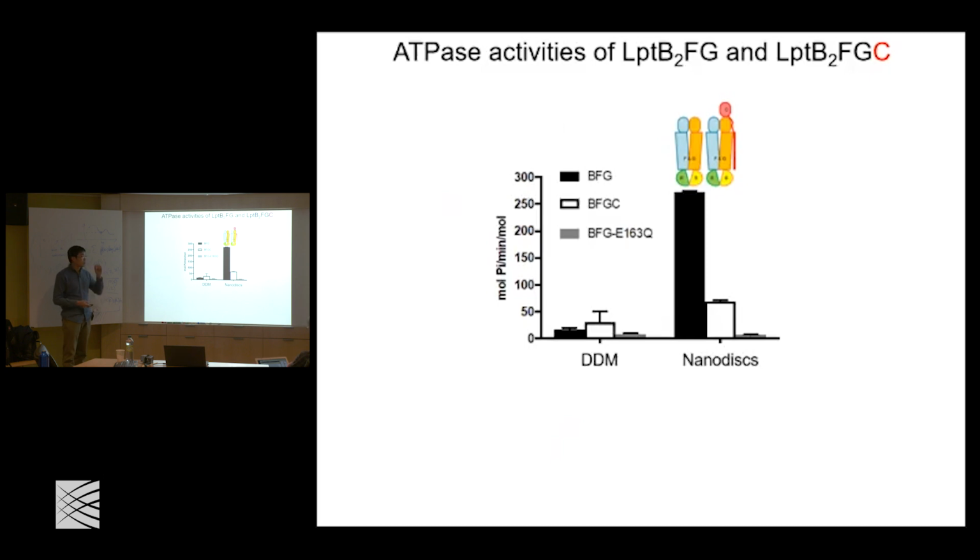That can probably only indicate two possibilities. One is that this high activity is somewhat not relevant because we took out one protein. Second is maybe that's the true activity, but in the resting state with LptC, it's a self-inhibited state.